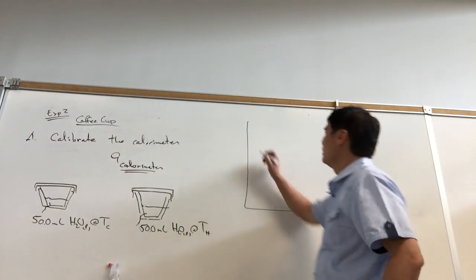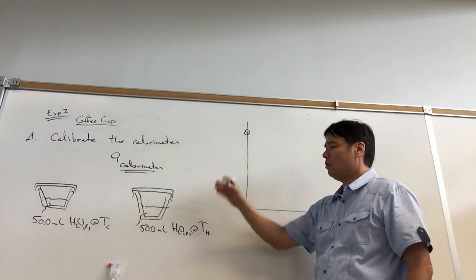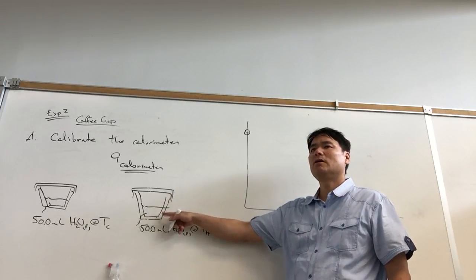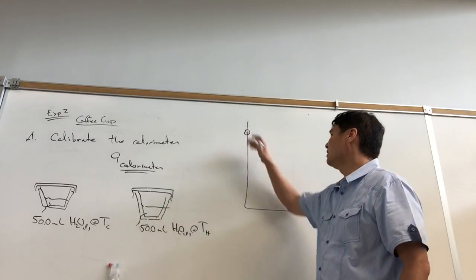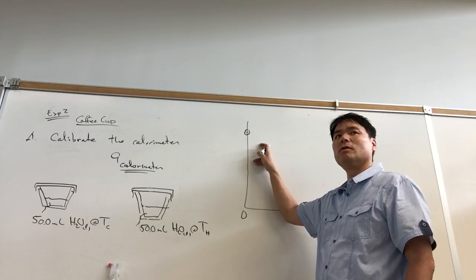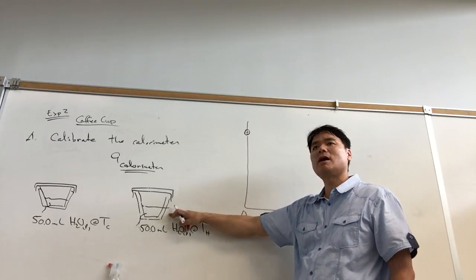As we monitor the hot water, first thing is we heat up the water on the hot plate, we measure it in a grad cylinder, and then we pour it into the styrofoam cup. Once it's poured into the styrofoam cup, it's going to stay there. Once we get it in the styrofoam cup, that's when we're going to start monitoring the temperature with our LabQuest data system. And so here's the hot water in the styrofoam cup.